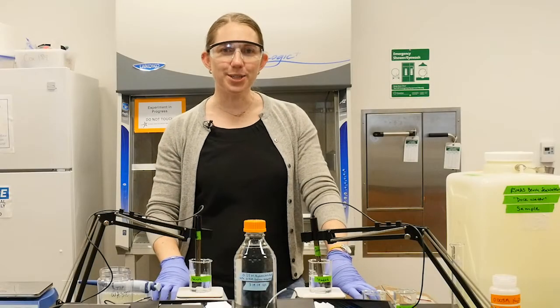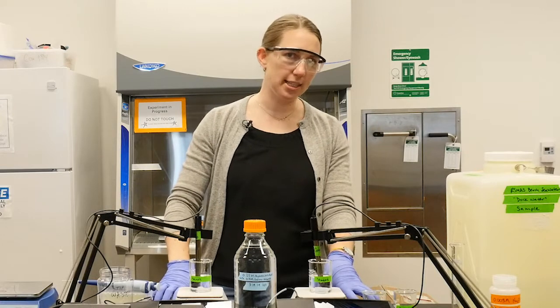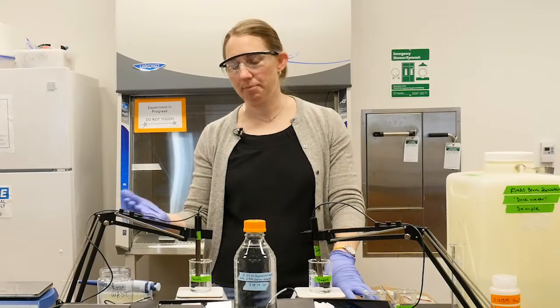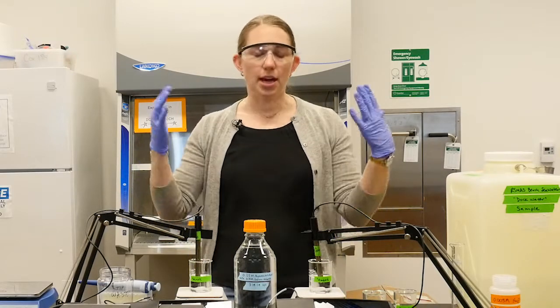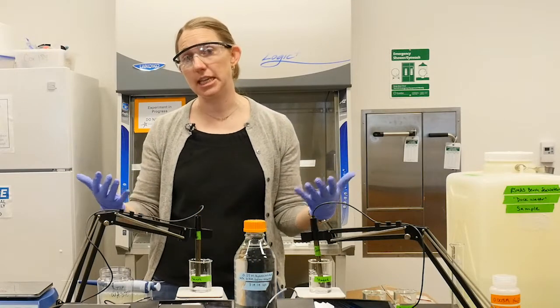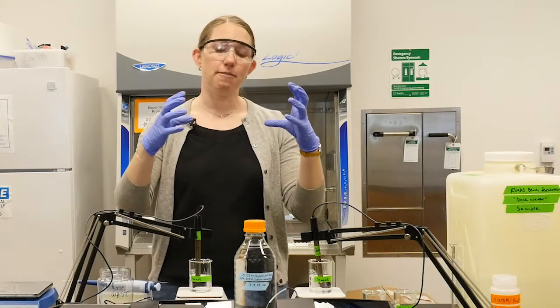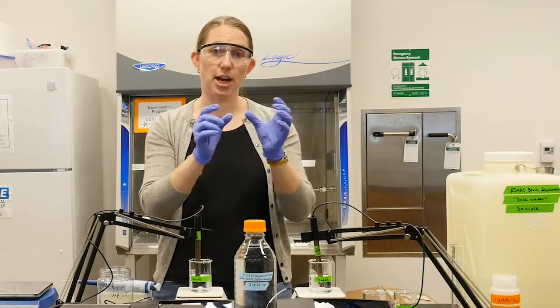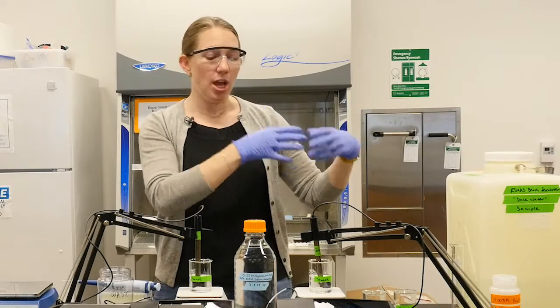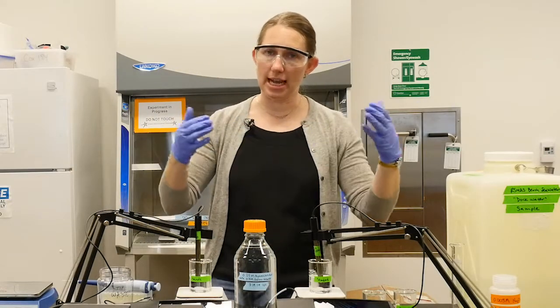Welcome to the lab. So today we're going to be measuring total dissolved carbon dioxide in seawater, and we're going to be approximating that by a measure of alkalinity. So we're looking at the carbonate system, which, remember, when CO2 dissolves into seawater, it forms three different chemical species. You have your fully protonated form, which is carbonic acid. You have the form that just has one hydrogen ion, which is bicarbonate, and then the form that has no hydrogen ions, which is carbonate. So we are going to be measuring the combination of these three forms today in a titration.